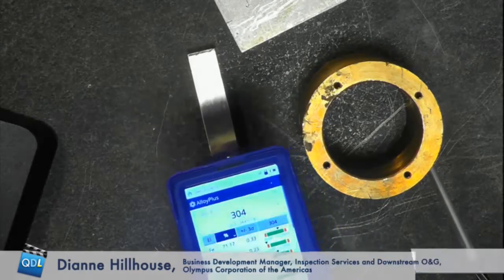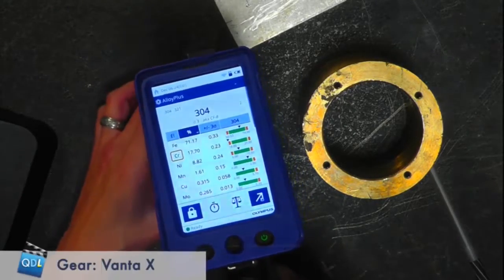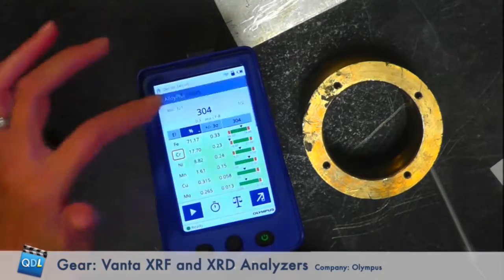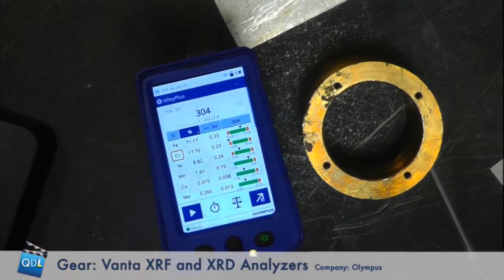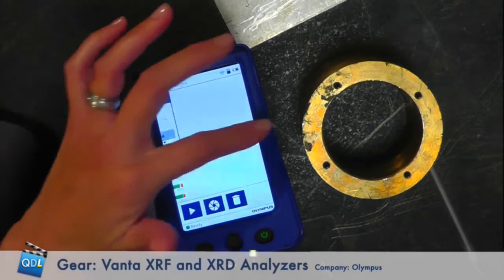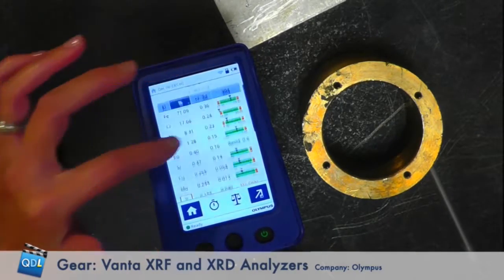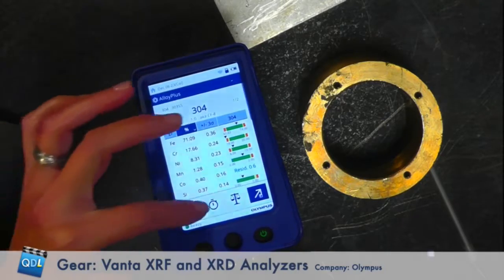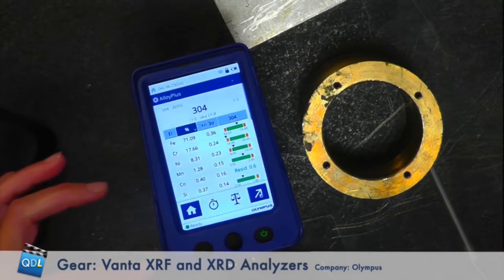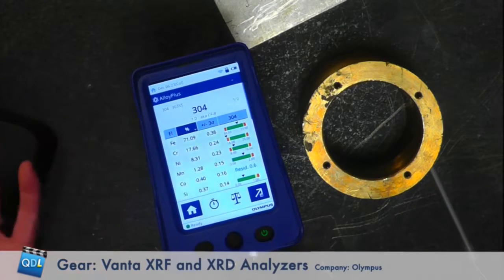Let's show how it works. Switching over to the gauge cam — we're going to test on what looks like some sort of extruded bar. The display looks like a smartphone screen, and that's intentional. The Vanta is designed with an interface that everybody's used to — your smartphone — where you're swiping from reading to reading. Your most-used operations are in the favorites tray at the bottom, and anything else is no more than two swipes or two buttons away.